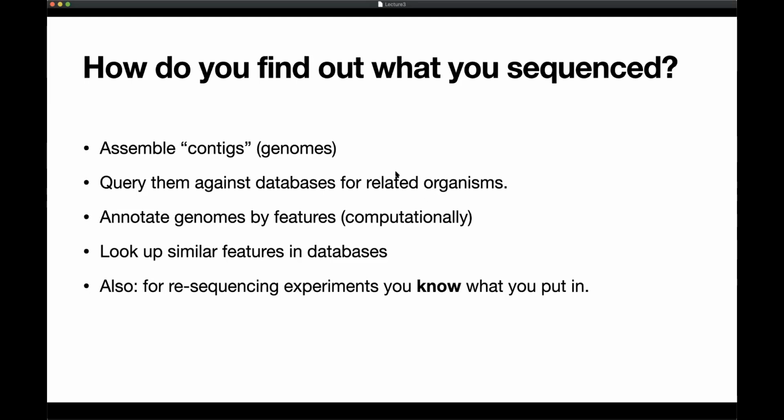Some of the earlier instruments like 454, which was the first next generation sequencing platform, had a really hard time calling genomes that had a bunch of the same nucleotide in a row. If you had 5 or 6 A's in a row, it would know that there were several A's, but it would have a very difficult time distinguishing 4 from 5 or 6, right? So that would be a sort of systematic error. But it depends a lot on the underlying platform, and it's pretty well characterized. So we have a good idea of which types of errors are random and which are not, and you can try to correct for them in a variety of ways.